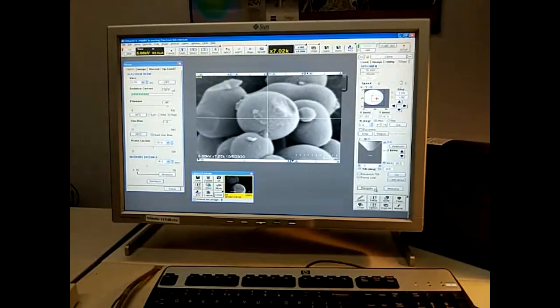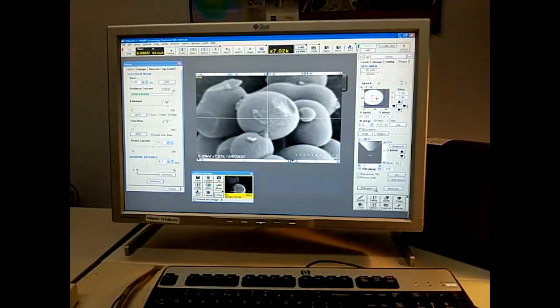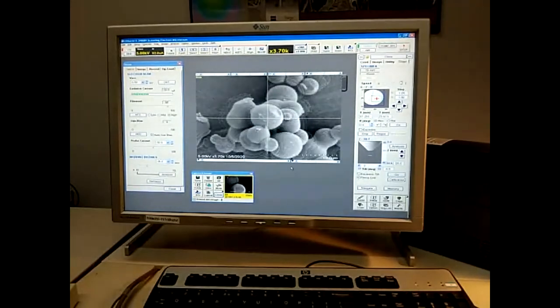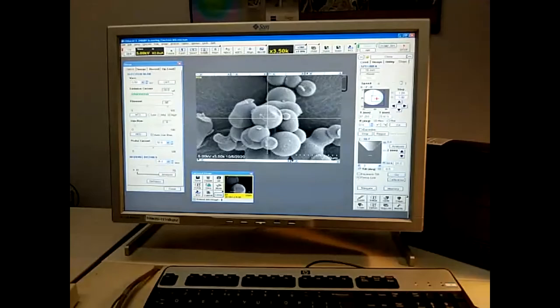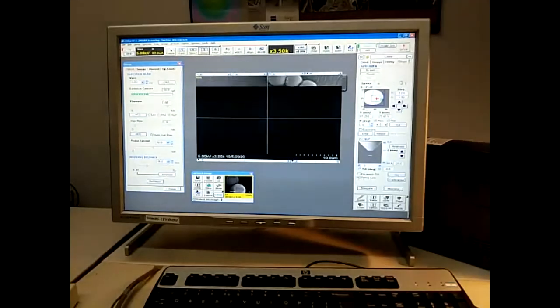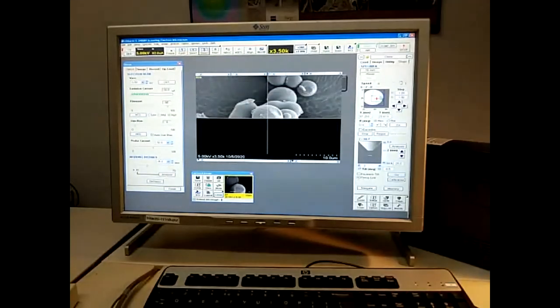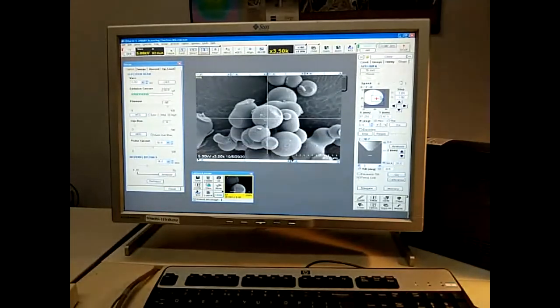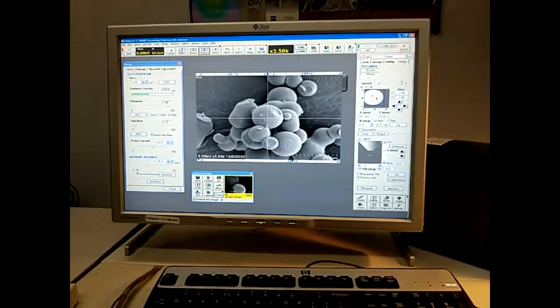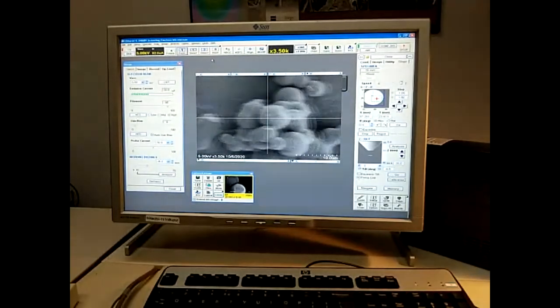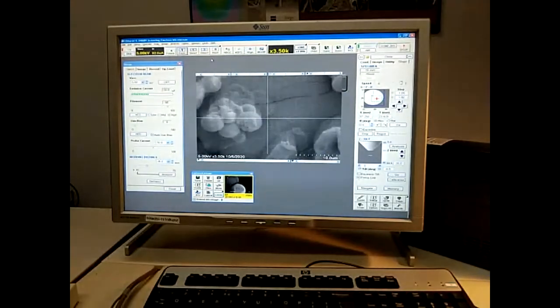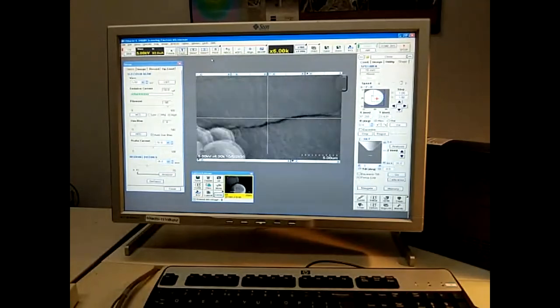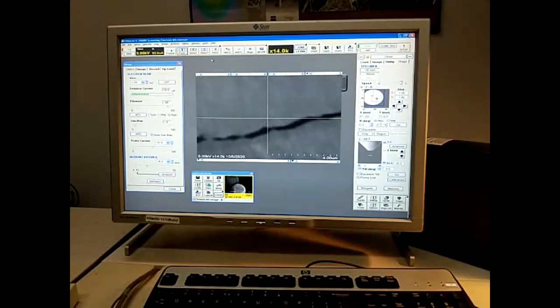As you move out you're losing a few electrons, so it's a bit of a trade-off when you have things that are quite three-dimensional like this, but we can put it in slow mode. Working at the lower magnification tends to give you the surface texture a little bit better. Come out here onto the carbon, onto this crack here. You kind of see how surface features look a little better when you're on low mode like this.